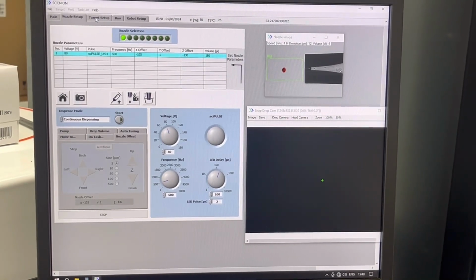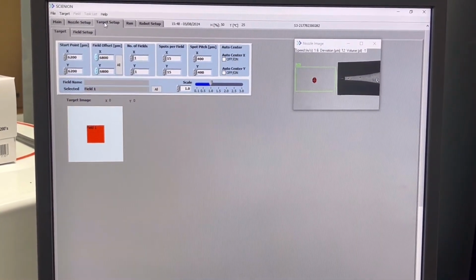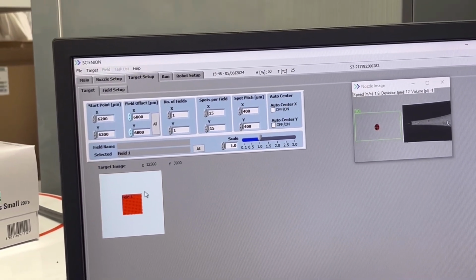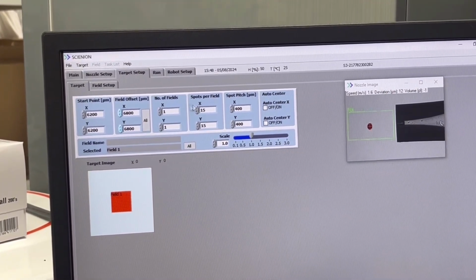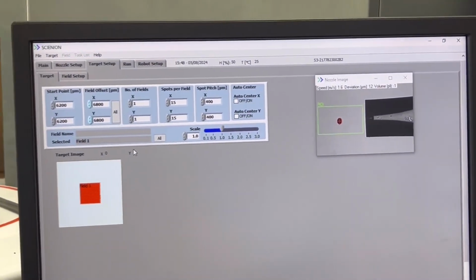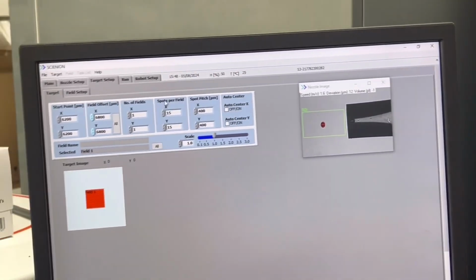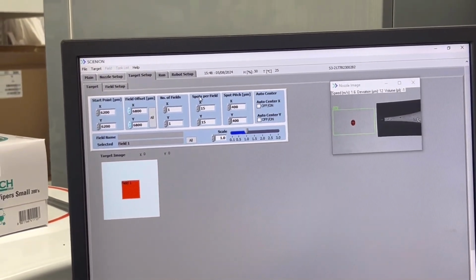And next step, you remember here. We will set the target, how many targets we use, and how many spots. You understand the spot? Spots mean the one point. Yeah, one point, one spot. Or we can use the droplet. Yeah, one spot, two spot, like this.